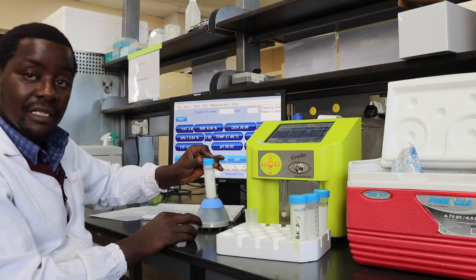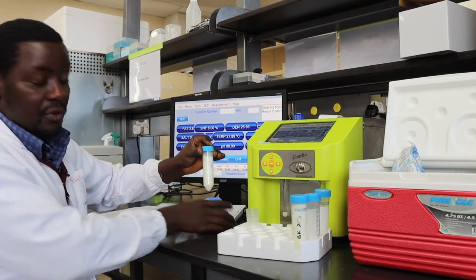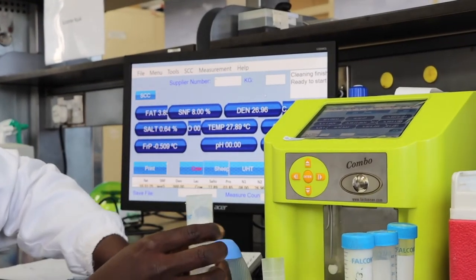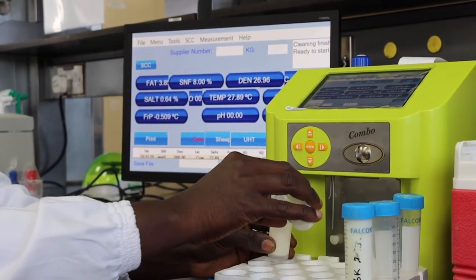Once the sample has achieved room temperature, the next step is to vortex the sample for at least 30 seconds. This ensures that the sample is adequately homogenized. The vortex is supplied alongside the equipment. With the homogenized sample ready, you transfer it into the sample vial that's provided with the instrument for analysis.